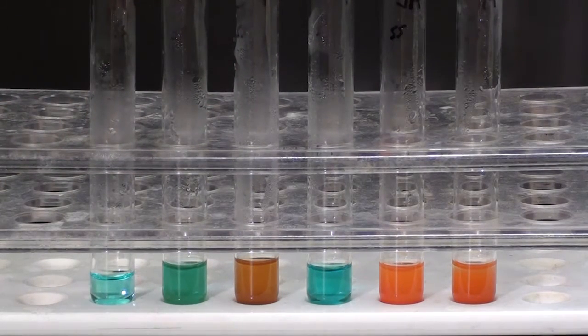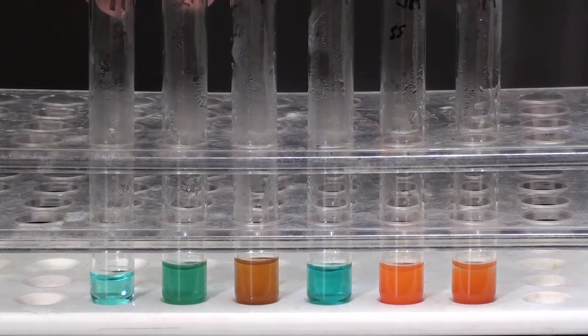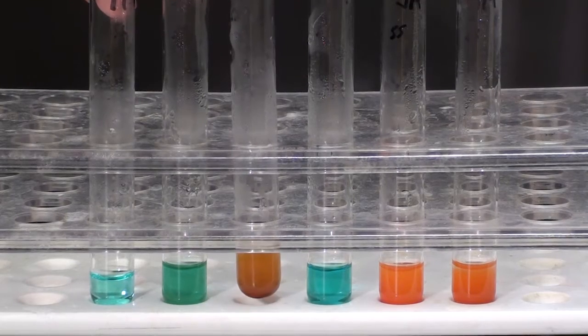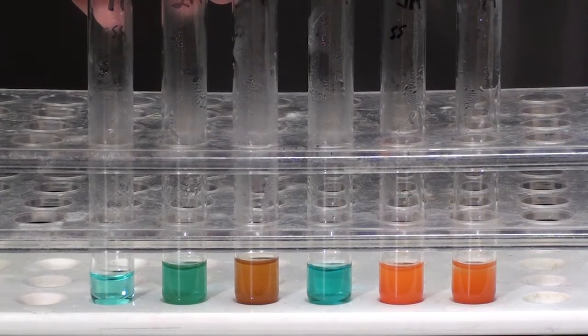Tube three was maltose, a sugar, and water left at body temperature for 30 minutes. You get a nice brick red color. That's the reaction between Benedict's and maltose.